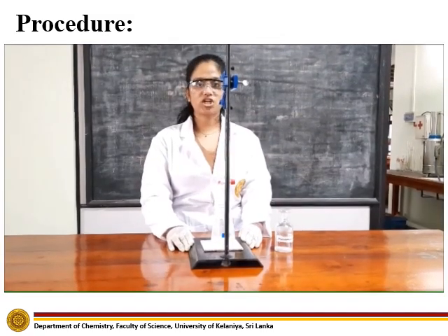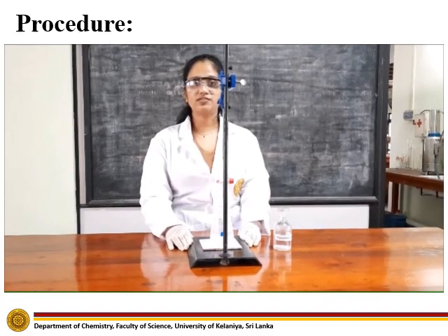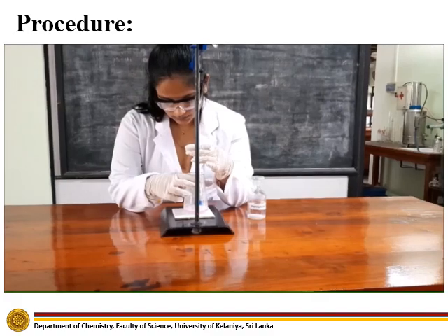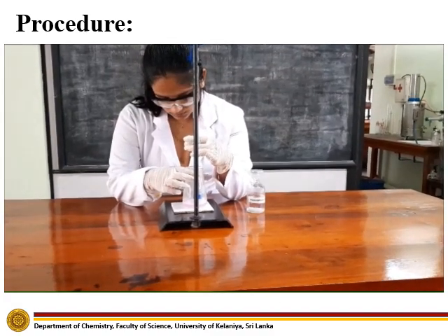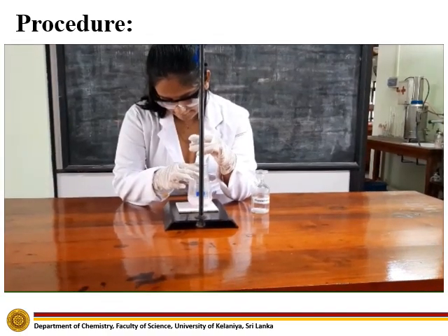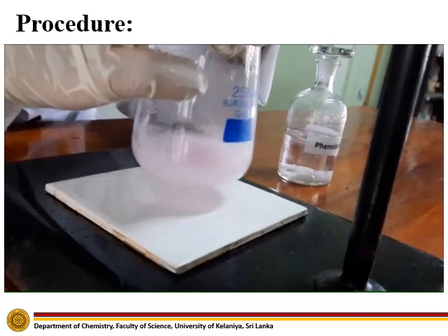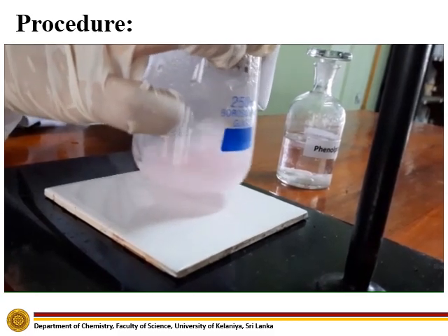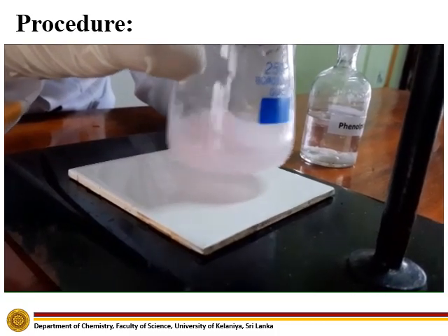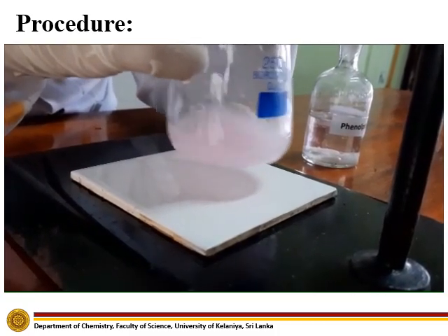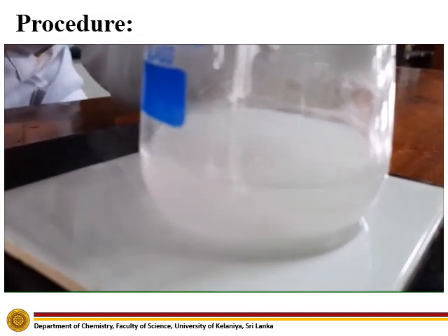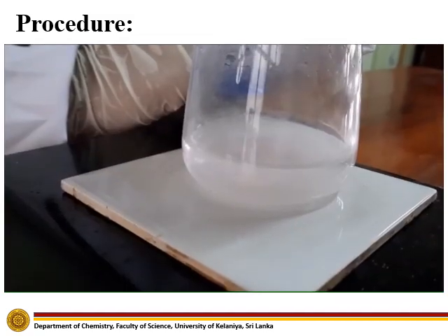Now let's also titrate 25 ml of calcium hydroxide solution at 90°C against HCl solution. This is the end point. Record the burette reading.